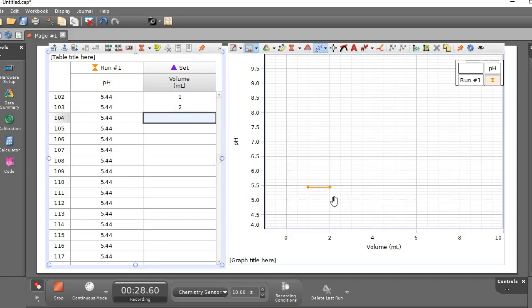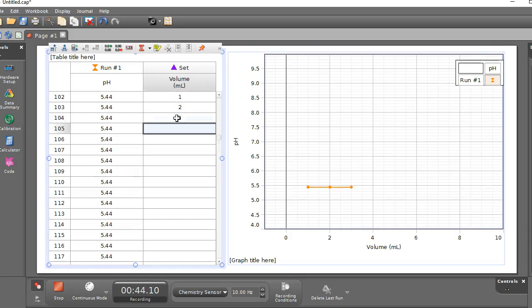So for a titration, what I've said before is that initially it will be okay to take measurements every milliliter, but as you get closer to the equivalence point, and you should know this by your pre-experiment that you did, your rough titration, by noting what those values were for your specific acid and base combination that you studied, you want to start taking measurements that are about 0.2 milliliters apart from each other, and then even closer, so about drop by drop as you're getting closer to that titration, so that you can have nice, tight scatter plot data showing you your equivalence point, so showing that spike that's going to happen, that vertical spike.